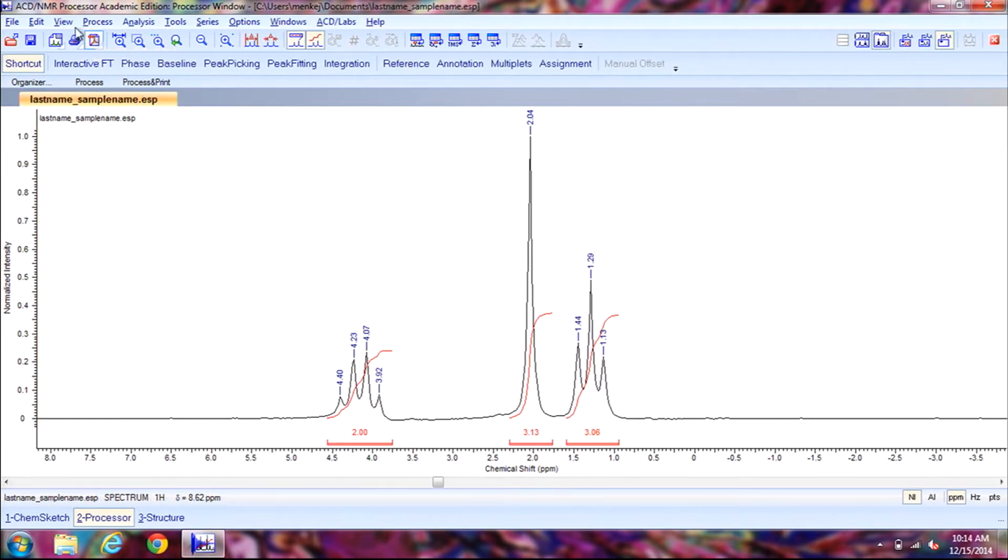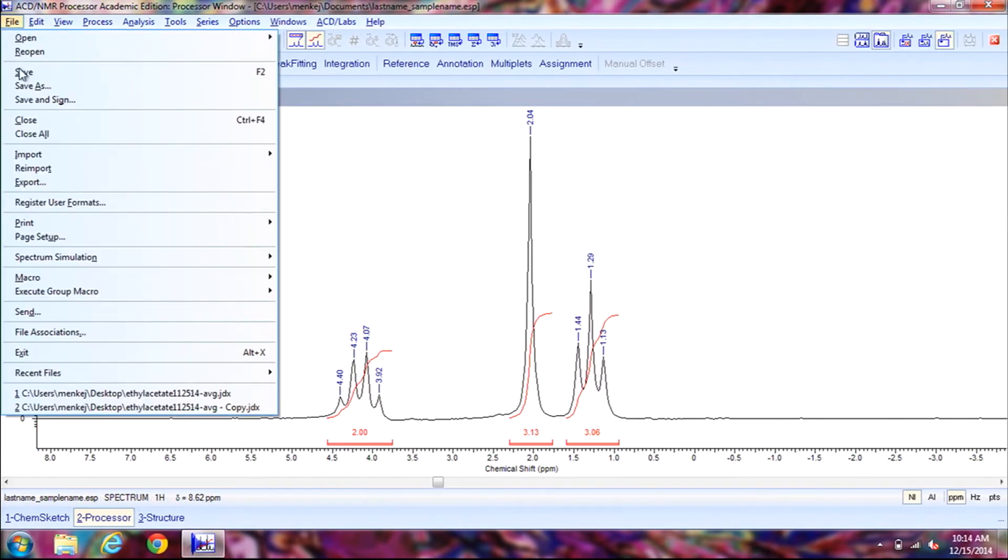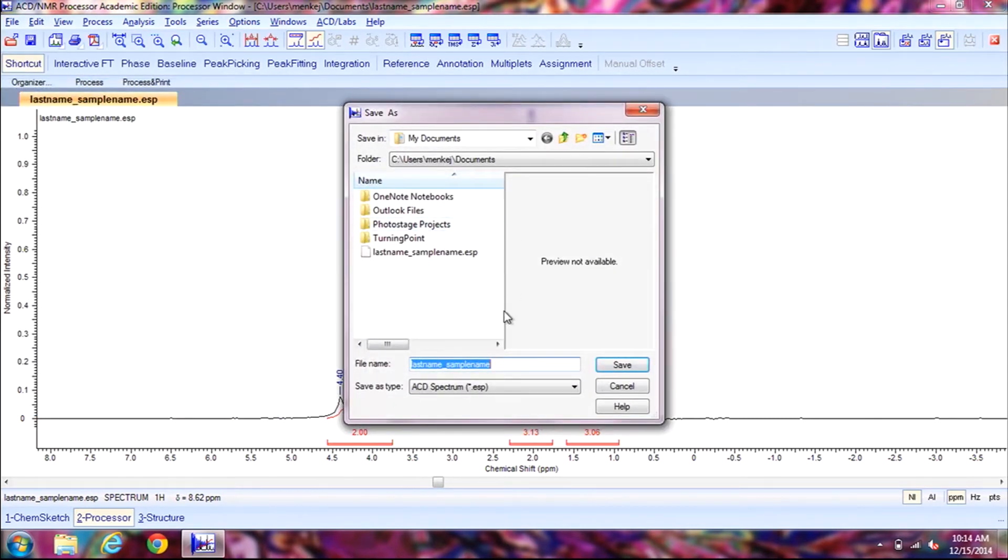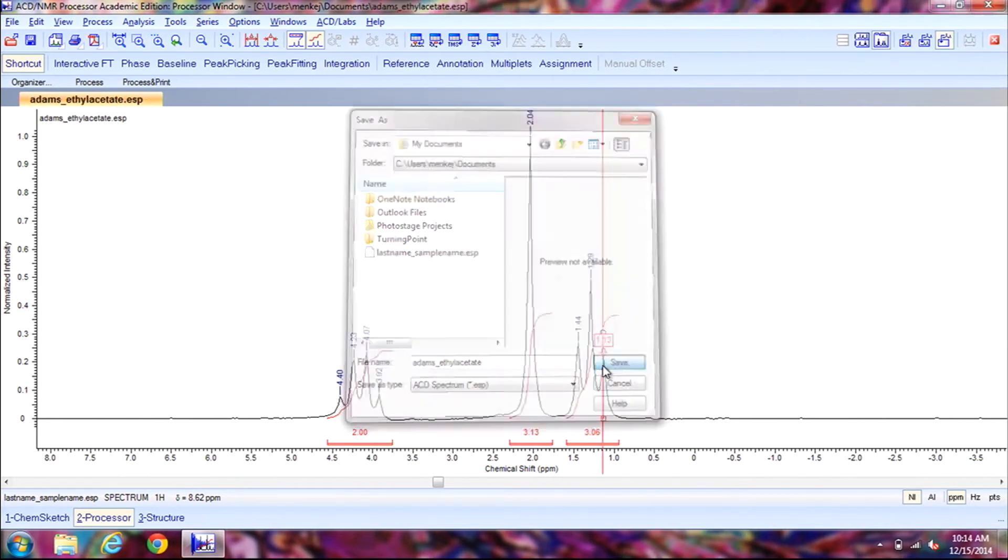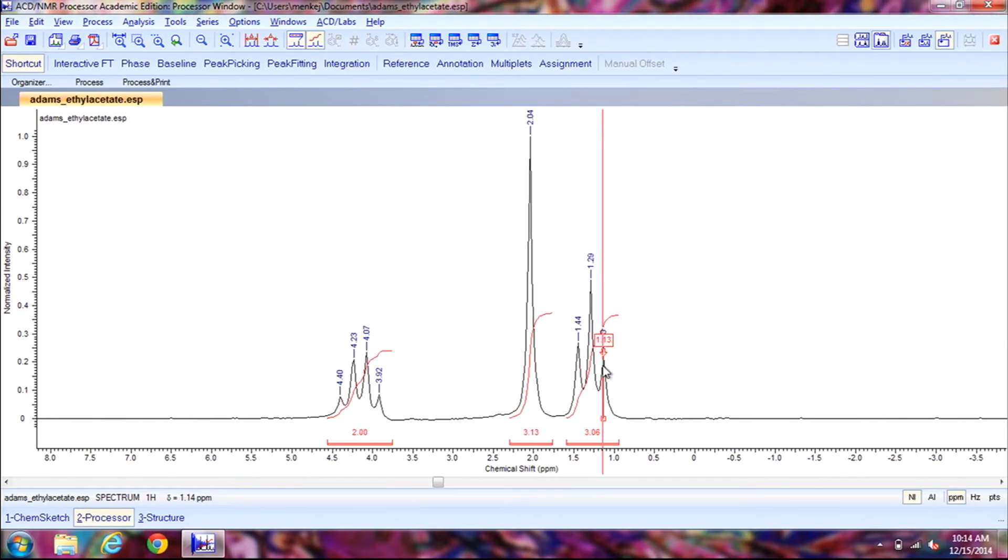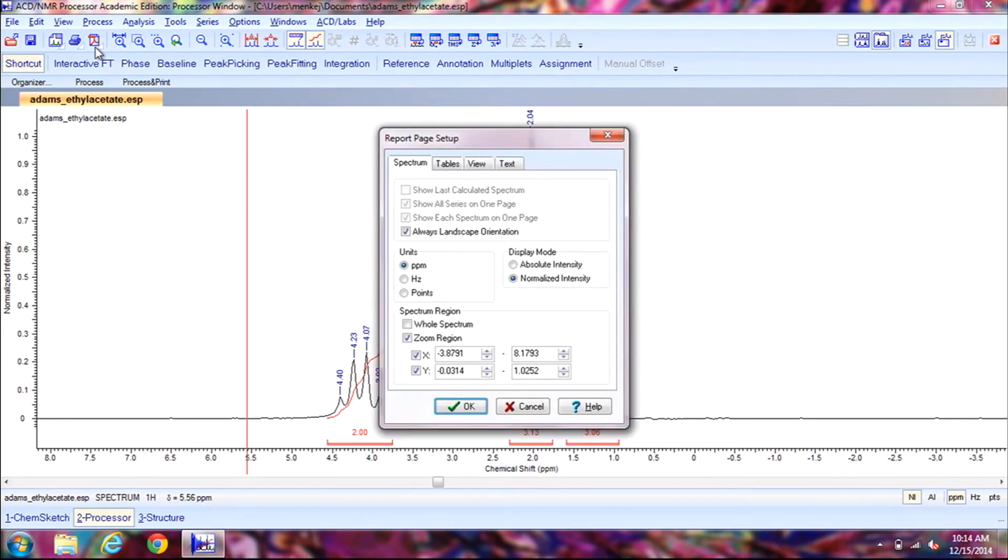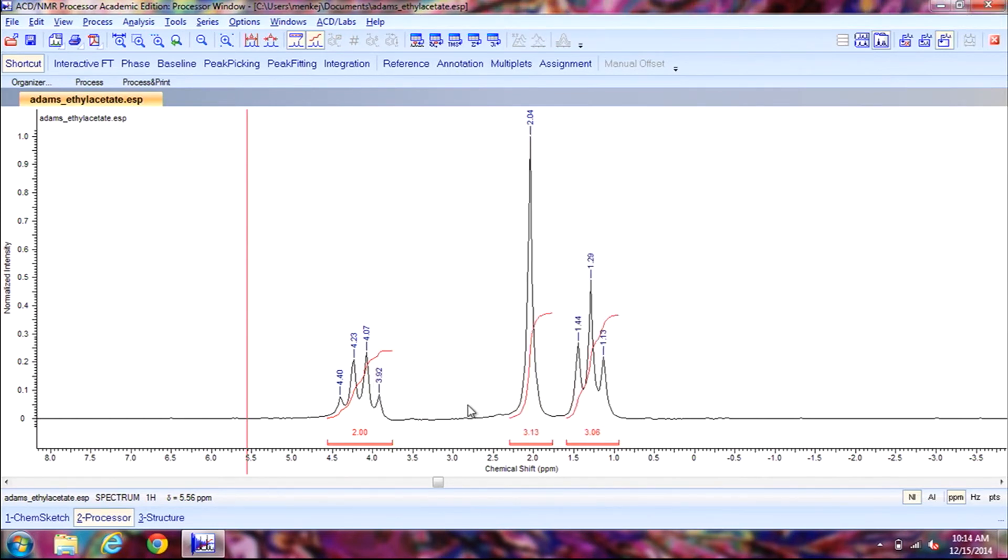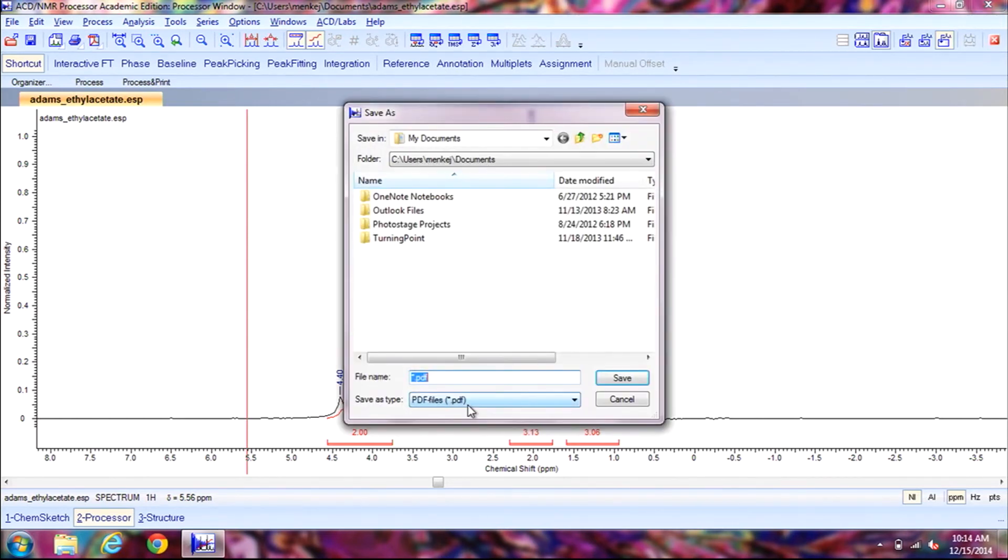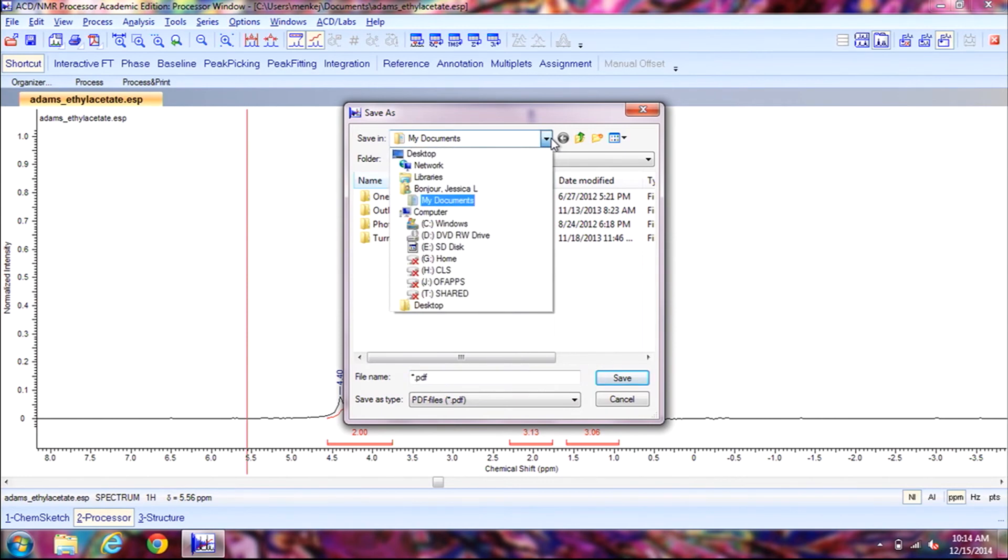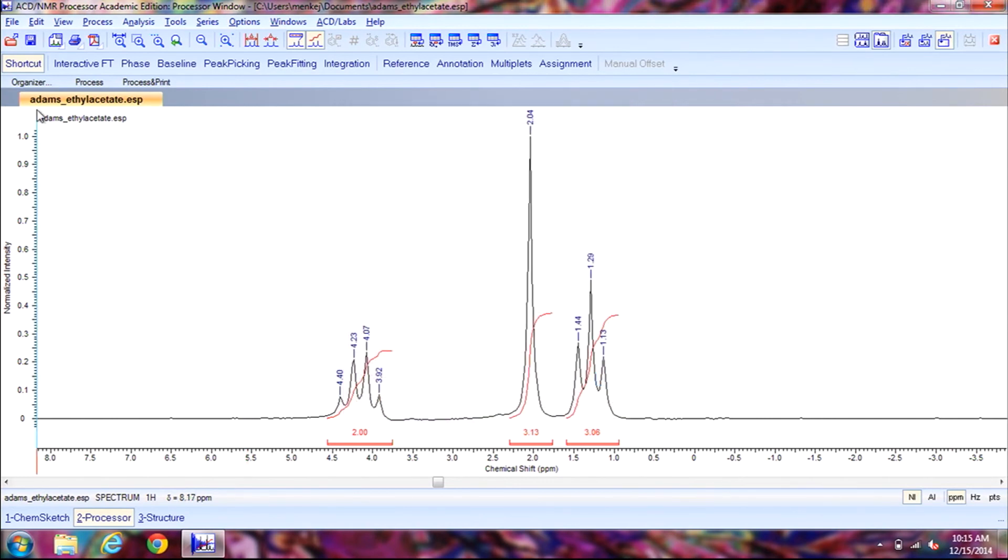Now to save our file we're going to go to file, save as. You want to label it as your last name and then your sample name and then click on save. You can also save it to a PDF file so that way you can print it later on. If you click on the PDF icon you can save it to a flash drive. Click on OK in the window that pops up, and then you can select here where your flash drive is to save it as. So this is how to analyze your spectrum using the ACD NMR processor.